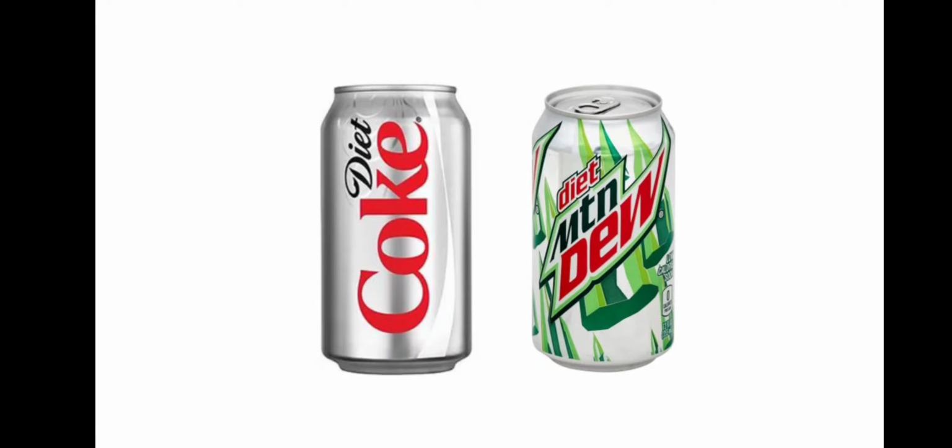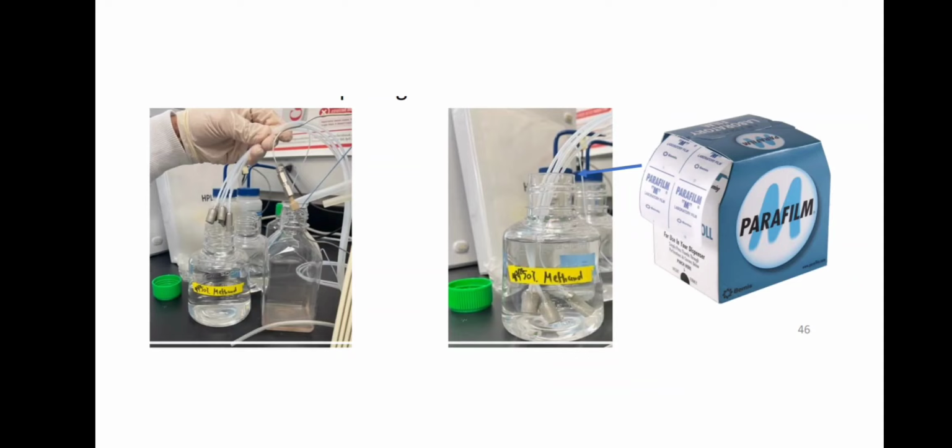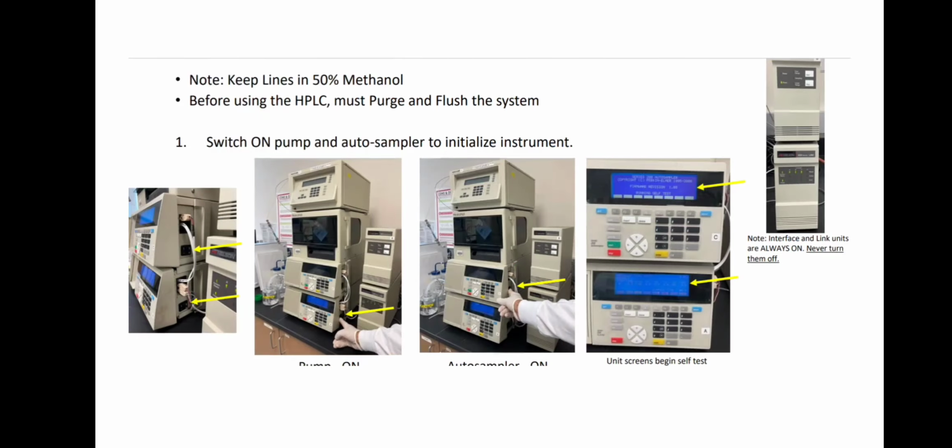implications of their consumption. This slide serves to highlight the importance of properly submerging the HPLC lines into a fresh methanol container. Ensuring that the lines are fully submerged in the solution helps prevent air bubbles from entering the system. To minimize contamination risk, cover the top of the container with parafilm. Before starting the analysis, it is essential to purge and flush the system.